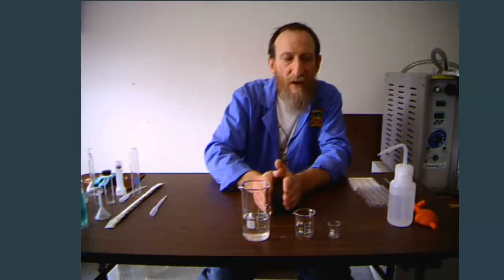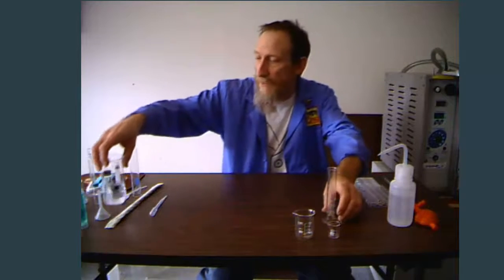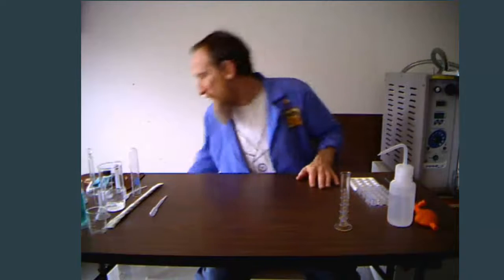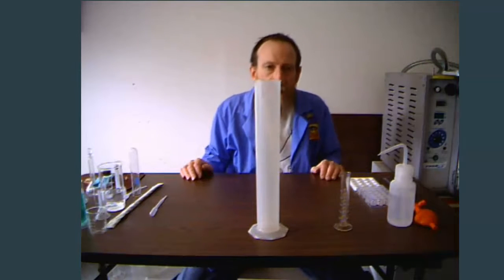If we want a more precise value, we would use a graduated cylinder. Sometimes I call this a smart cylinder — why? Because it's graduated! Because it's Kicked Up Chemistry, I like to kick it up a little bit, so I've got a larger graduated cylinder as well.